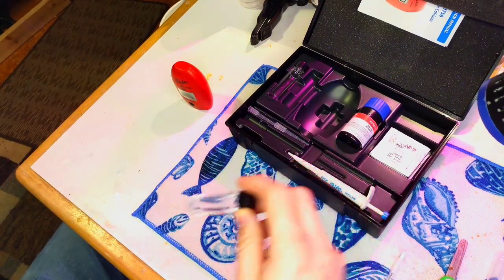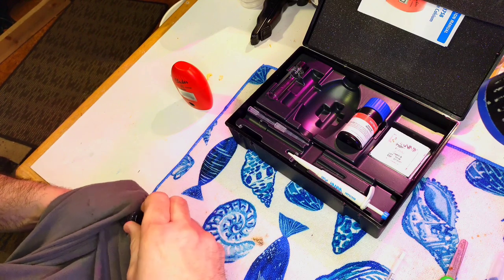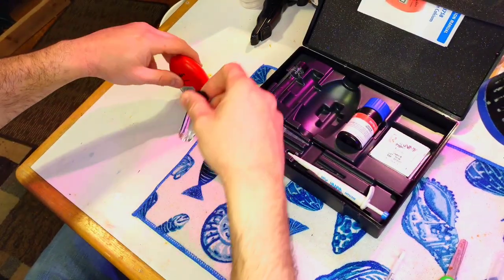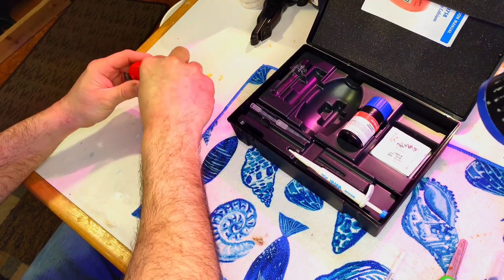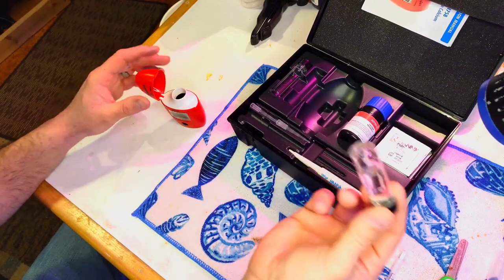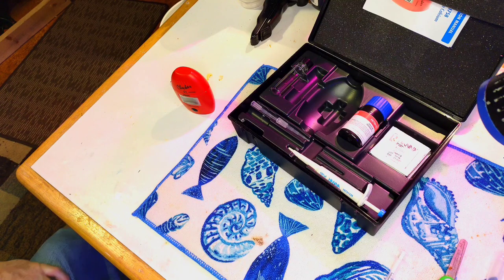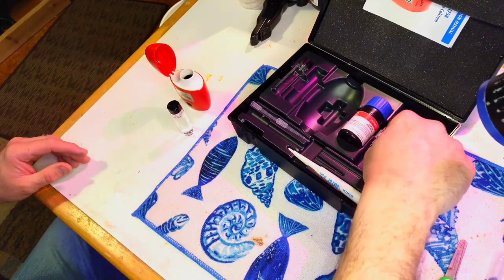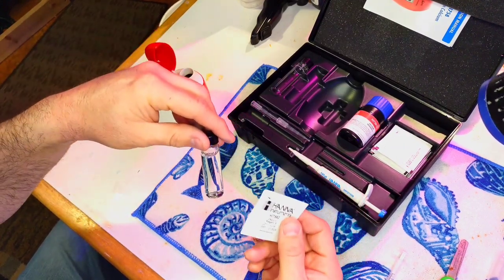Wipe off any fingerprints. I like to use my shirt since I tend to lose cloths. Put it in with the 10 milliliter mark facing front. Invert it even though it looks clear — the instructions say to do this. Hit C1 and now it's asking for C2. There are two different steps: first you put the tank sample in, then the reagent packet. You can do it in either order, though instructions say tank water first.